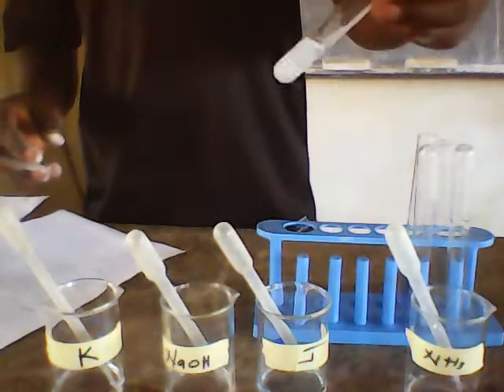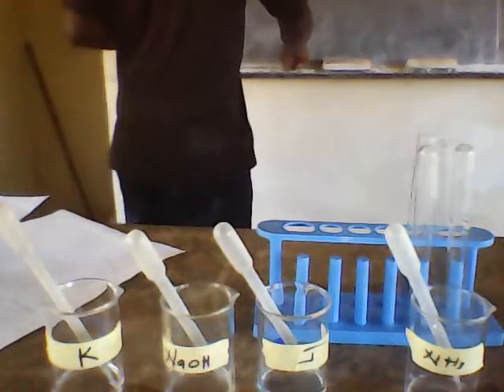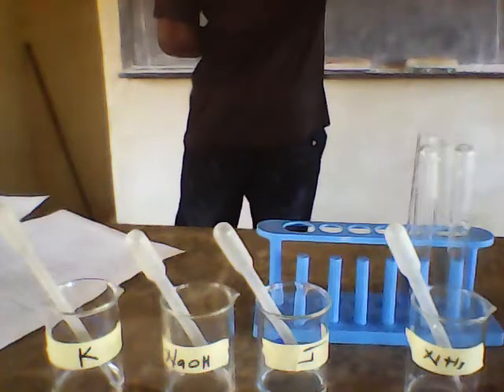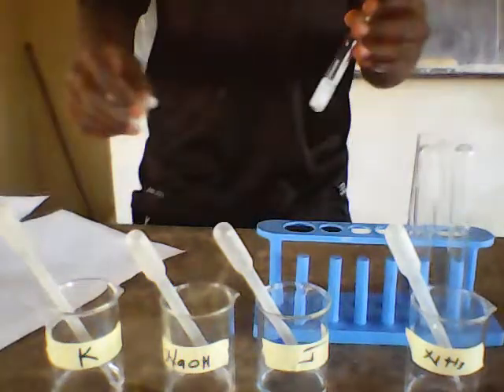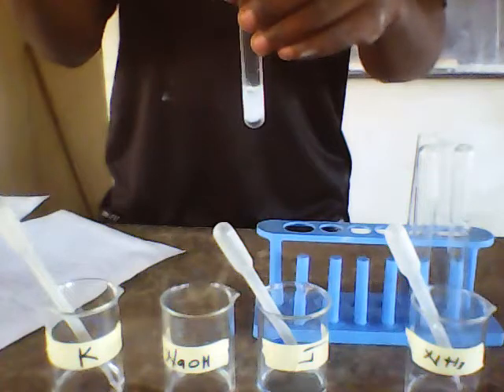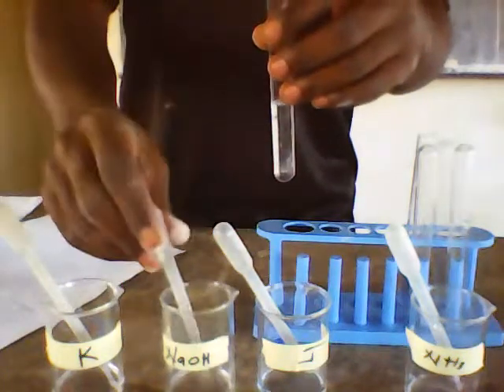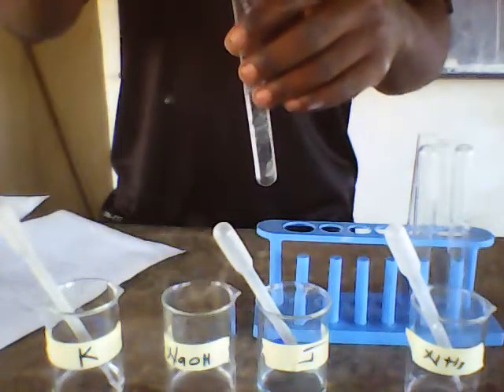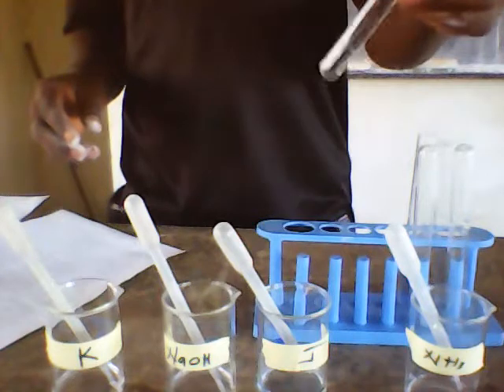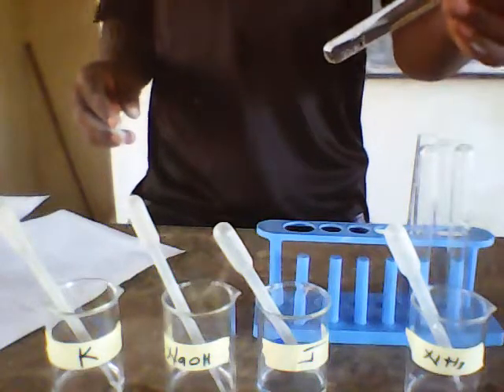As you can see here, I'm having a white precipitate. So my observation, I'm going to write: white precipitate has been formed. Then I'm going to add excess sodium hydroxide into the same test tube containing a small portion of sodium hydroxide and solution K. And here my observation, I'm getting a colorless solution. So my observation is going to be written as: the white precipitate has turned to a colorless solution.